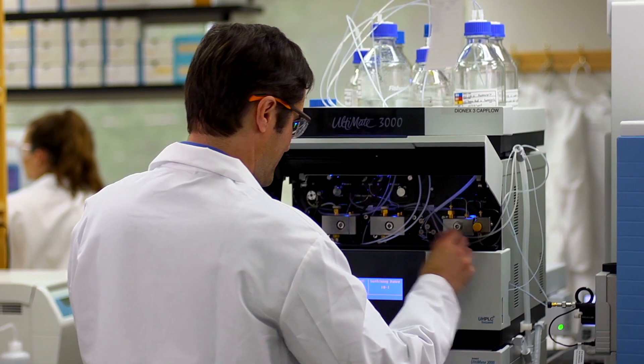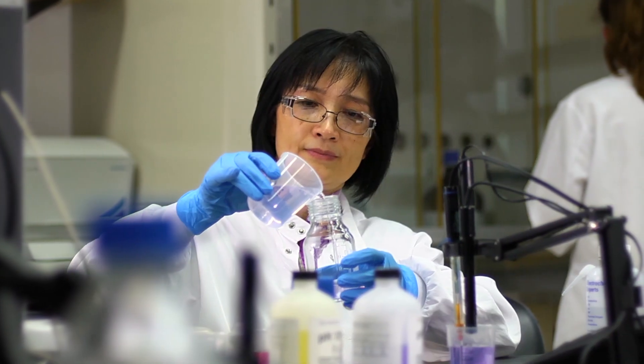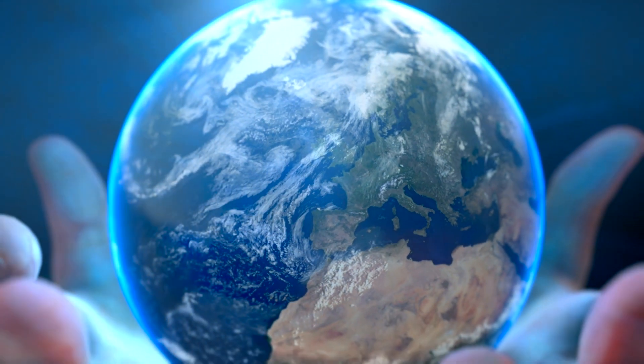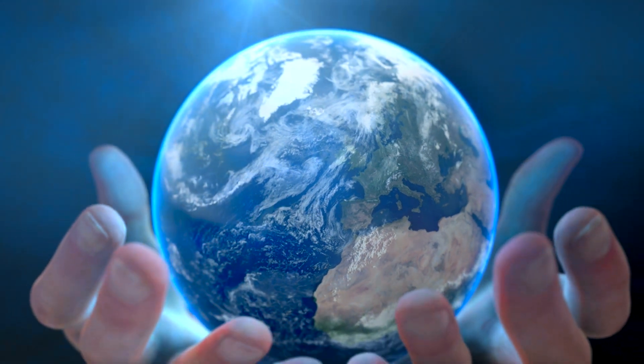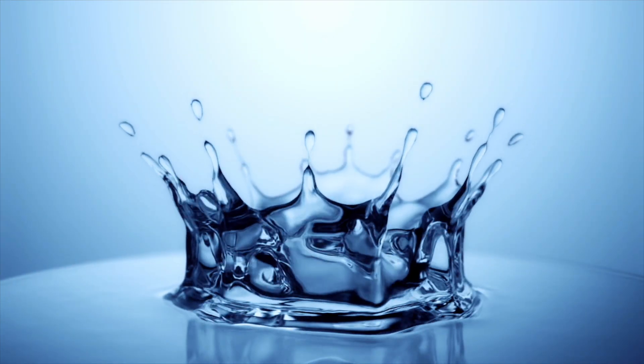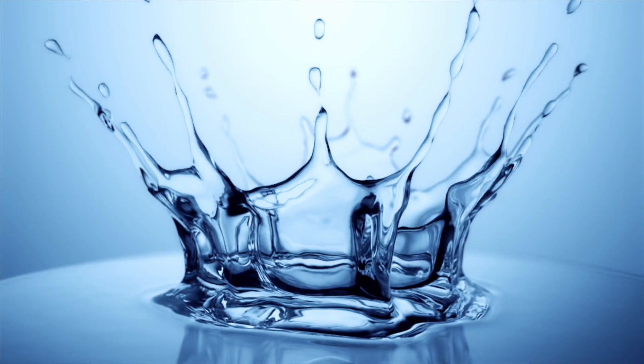You are the very heart and soul of the life science, biopharmaceutical, research and academic institutions whose work makes lives across the globe healthier, cleaner and safer. And you each use one consistent element that is an absolute necessity in your work: Ultra-Pure Water. The Ultra-Pure Water delivered through the Thermo-Scientific Barnstead SmarterPure Pro Water System ensures there are no contaminants that interfere with your research.